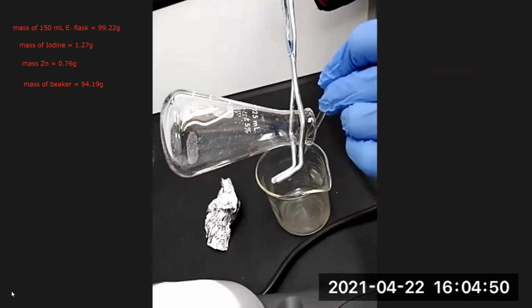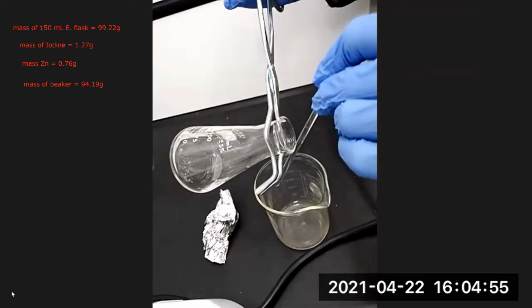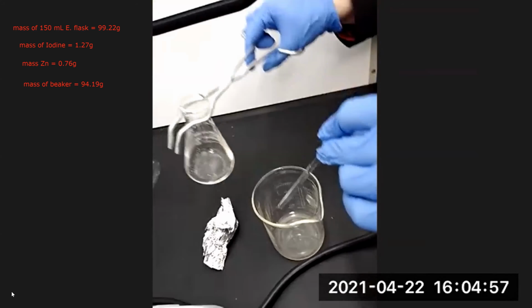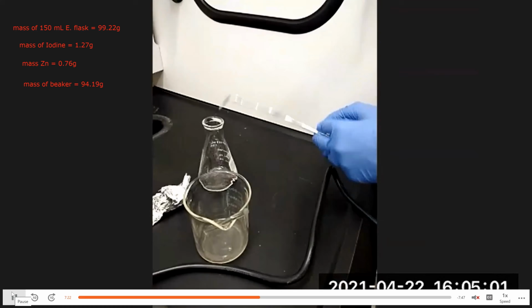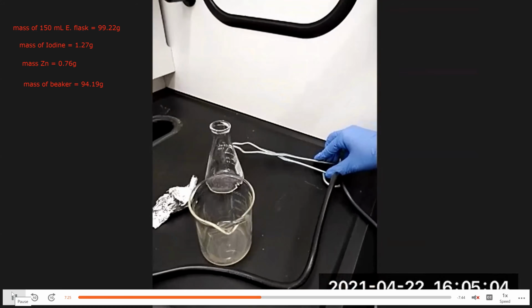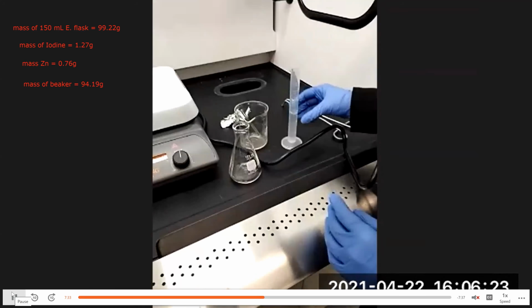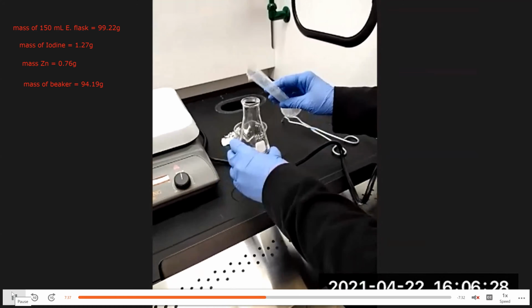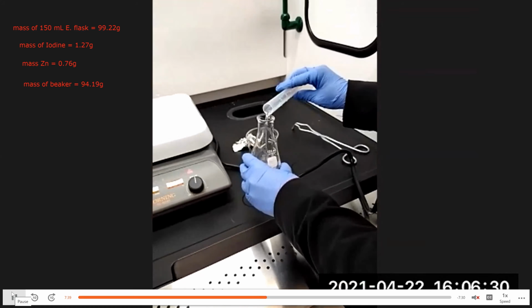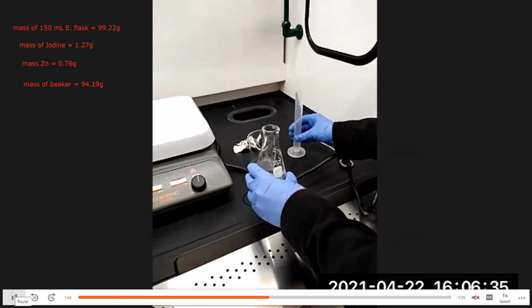We're also going to wash the unreacted zinc with a little methanol to make sure we get all the product out. So we're going to add a little methanol to it, about 5 milliliters at a time. We swirl it around and then pour the solution into the beaker.